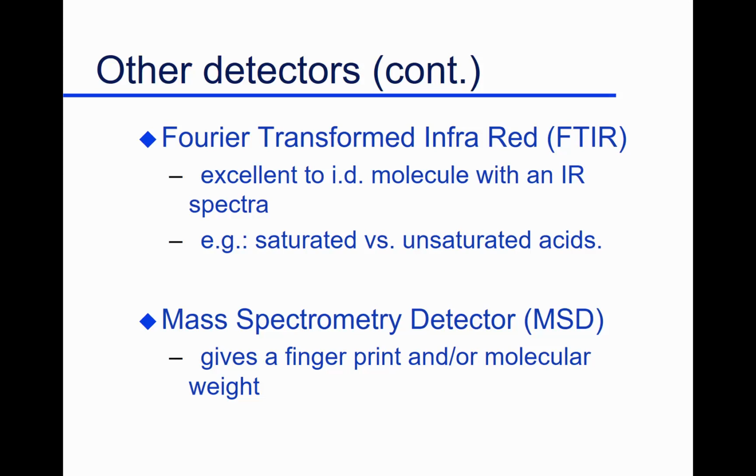Things that are specific make cleanup less important. We have to spend less time to make things clean or pure. So it does save us in terms of sample preparation as well. We've had infrared detectors. They've largely gone out of use.